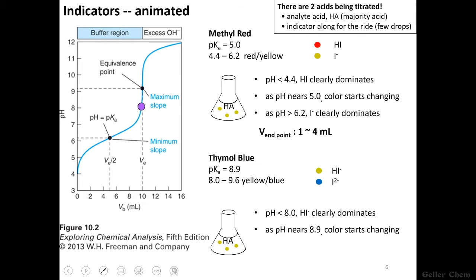We're about to reach it. And then we are now in the range, and as pH rises, this becomes more and more blue. We're having green shades, and now we're at blue because our pH is above 9.6. And from here on out, this solution will continue to be blue. Notice this one is still yellow because we've only gotten higher and higher than that upper range.